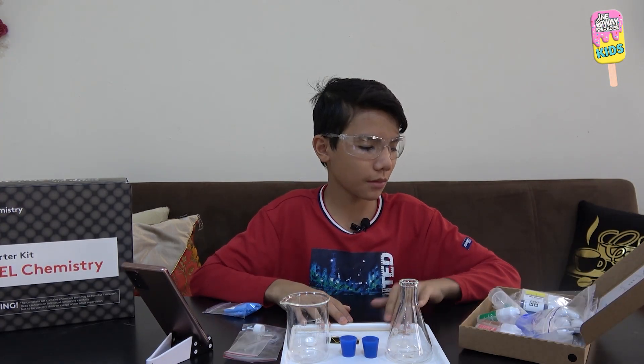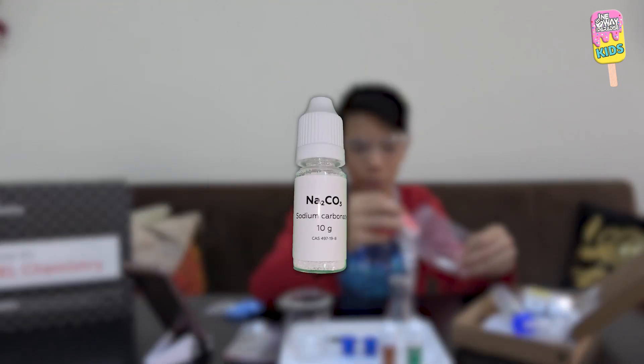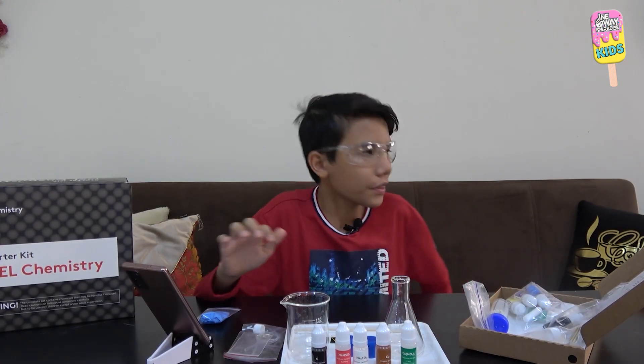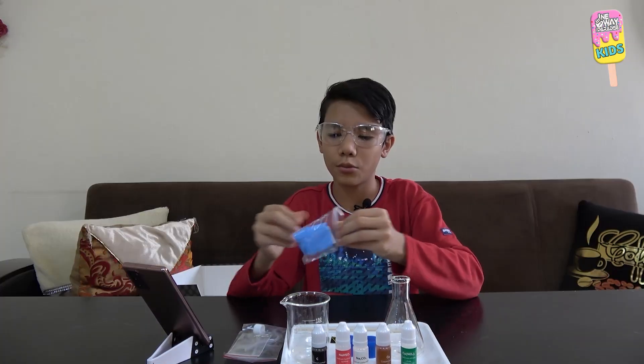Now I will take some chemicals. I'll take some calcium nitrate, copper powder, sodium carbonate, sodium hydrogen sulfate, and last but not least, activated carbon, also known as charcoal. I will open the windows because we need to perform this in a well-ventilated area.